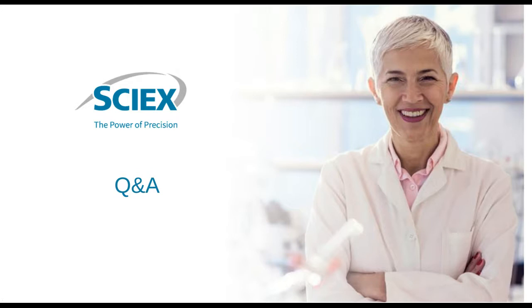Great, thank you. Then the next question is a simple one. Is the ZipChip 96 well plate compatible? Yes, it is. There we go. Quick answer.